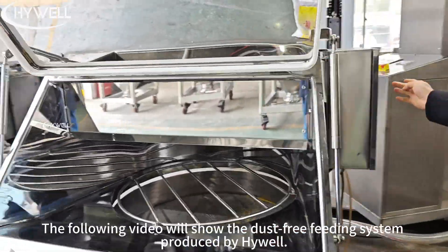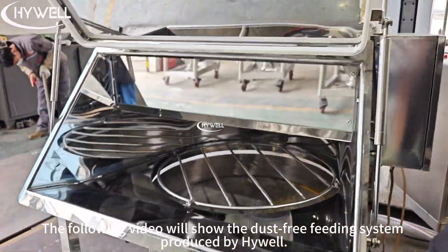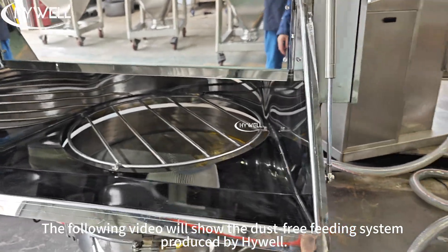Do you know what a dust-free feeding system is? The following video will show the dust-free feeding system produced by HiWell.